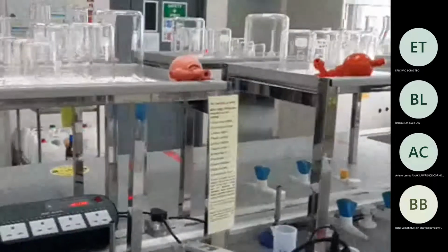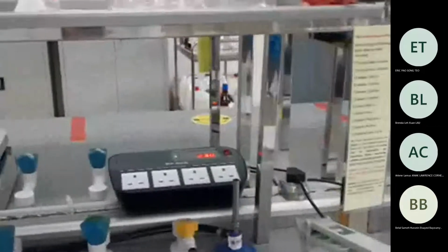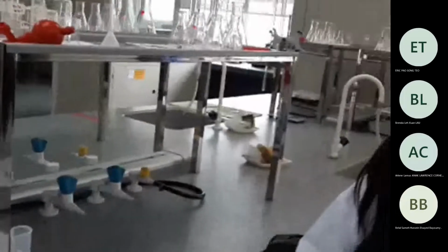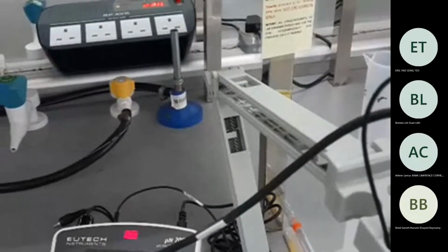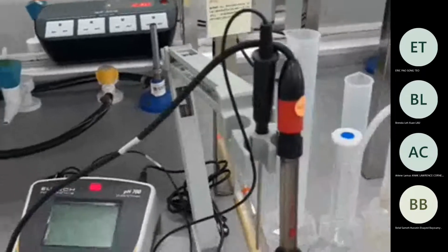And these are the pH meters. Do I need to do the calibration? No need. Okay. So for this pH meter, we have to use both together inside. Okay. So this is the pH meter. We will be using it to determine the pH of the solution that is given as per the methodology for this experiment.